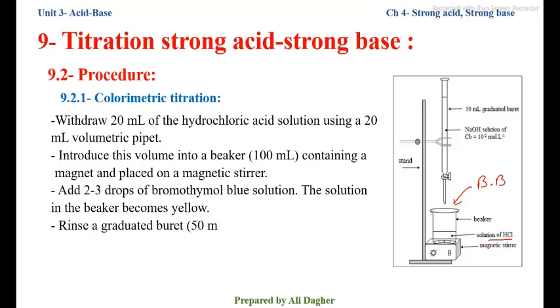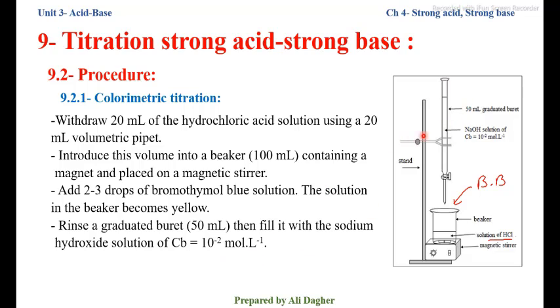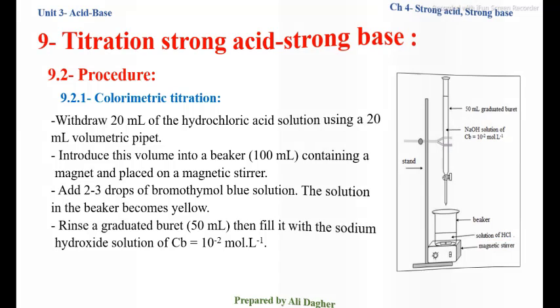Rinse the graduated burette, first using distilled water, then using the sodium hydroxide solution, and after that we fill it with the sodium hydroxide solution of concentration Cb equal to 10^-2 mol per liter.